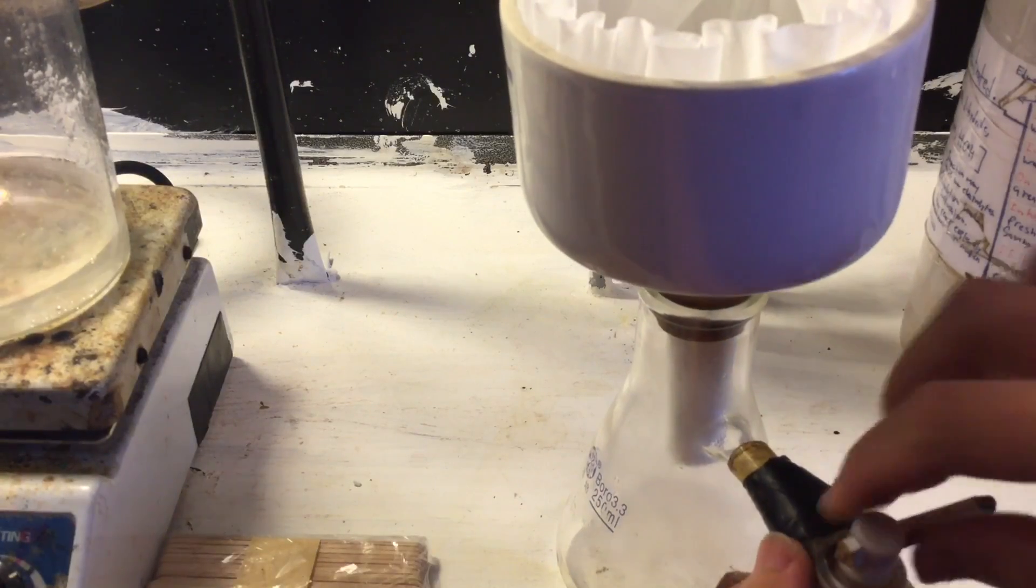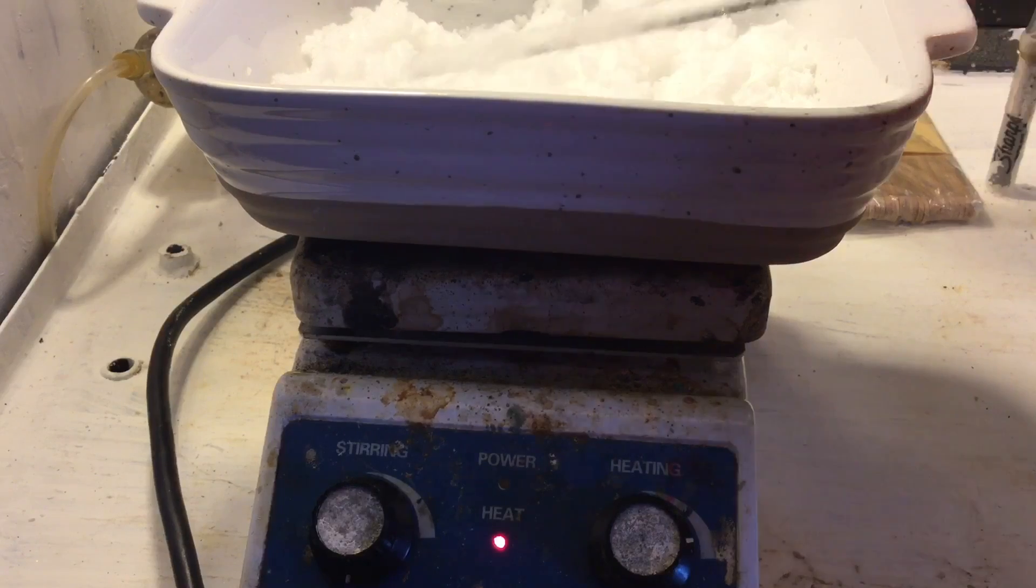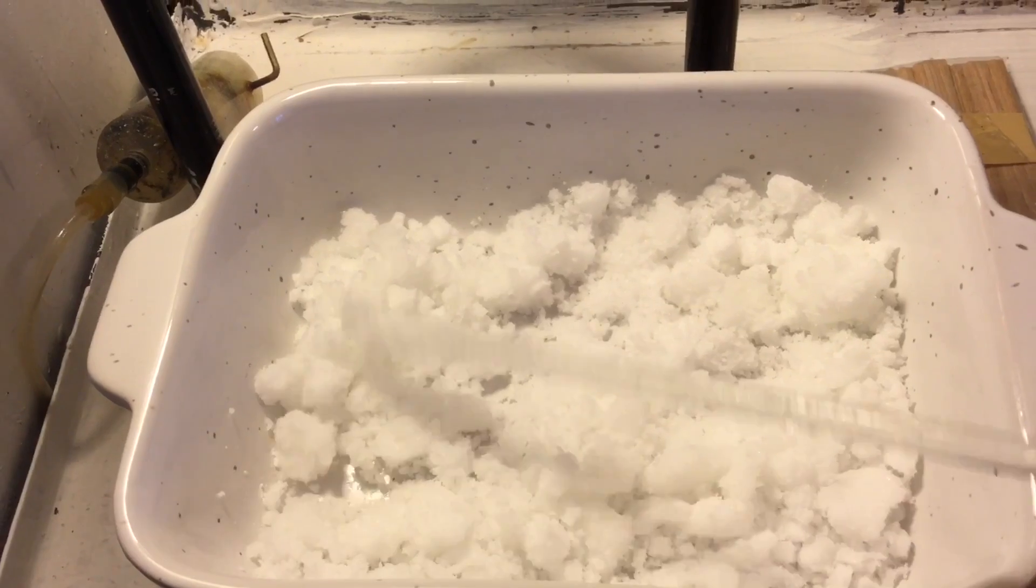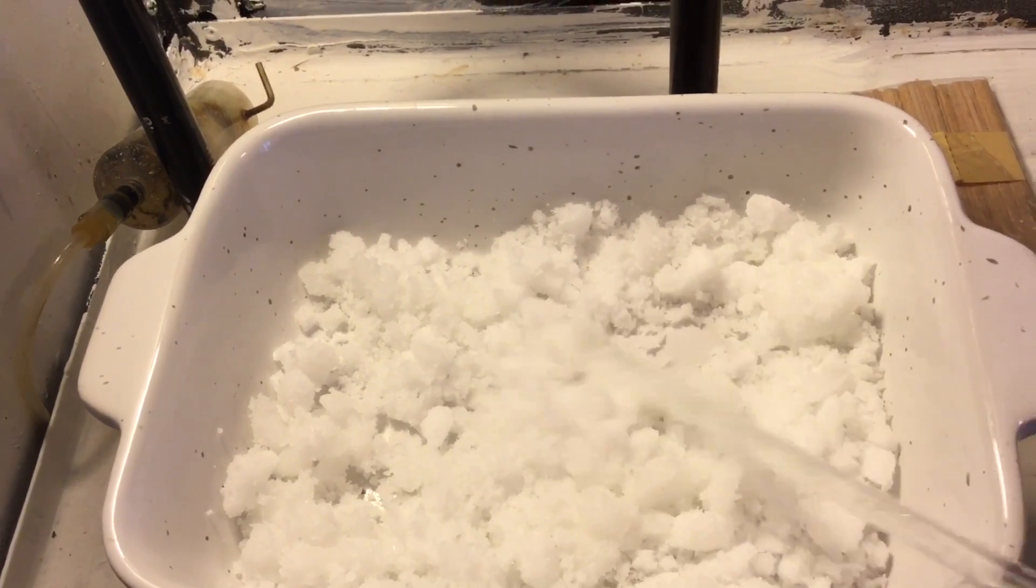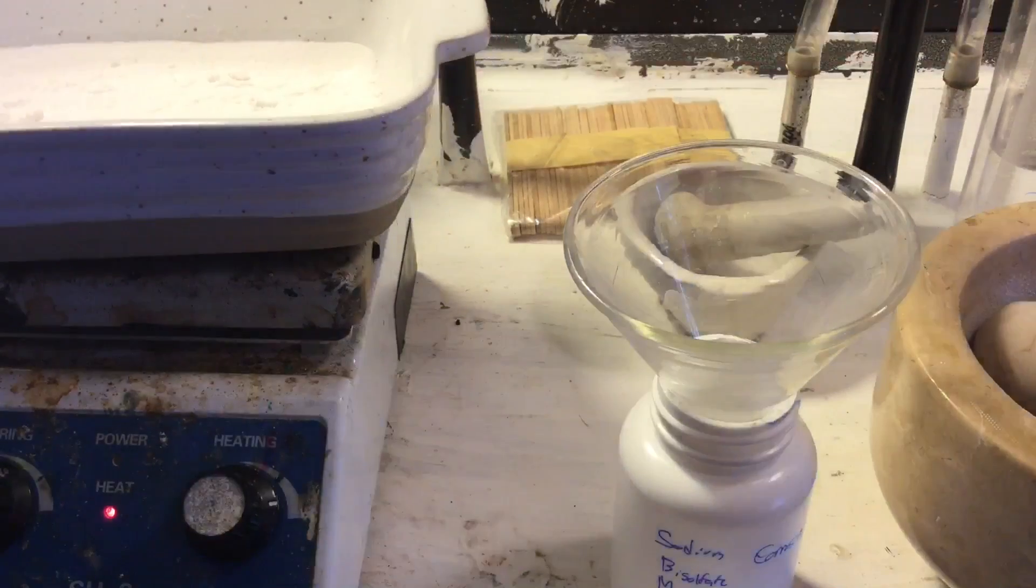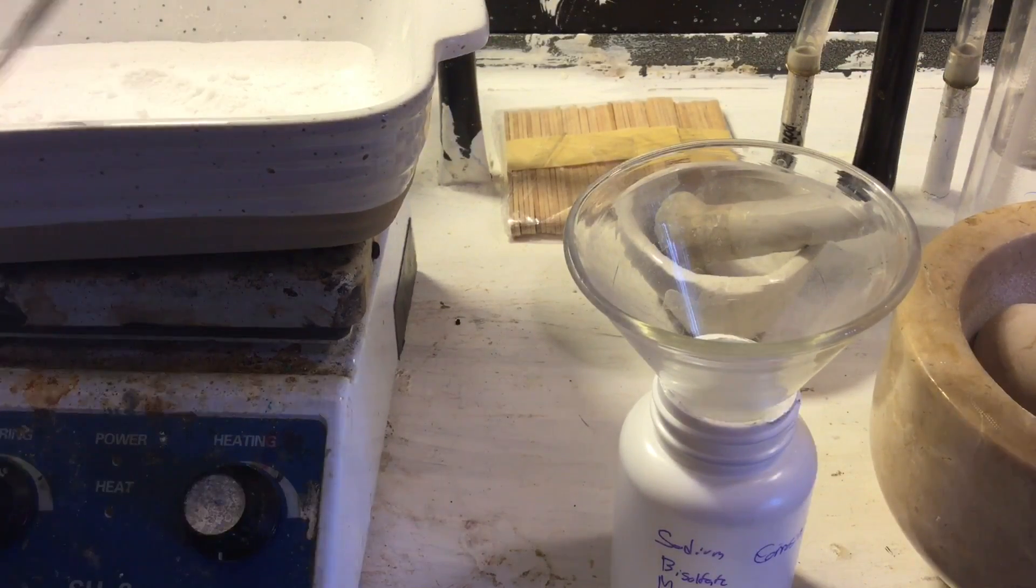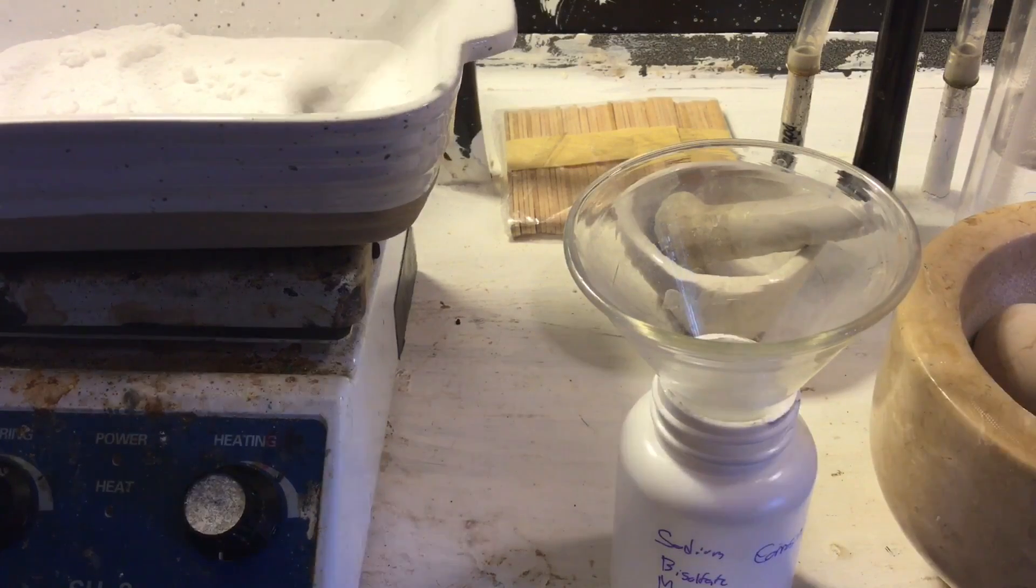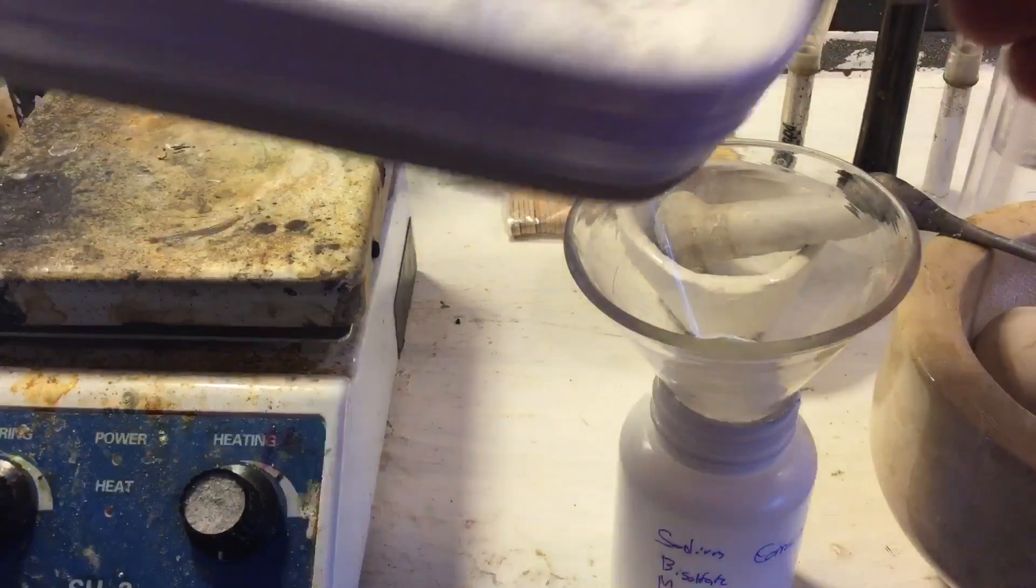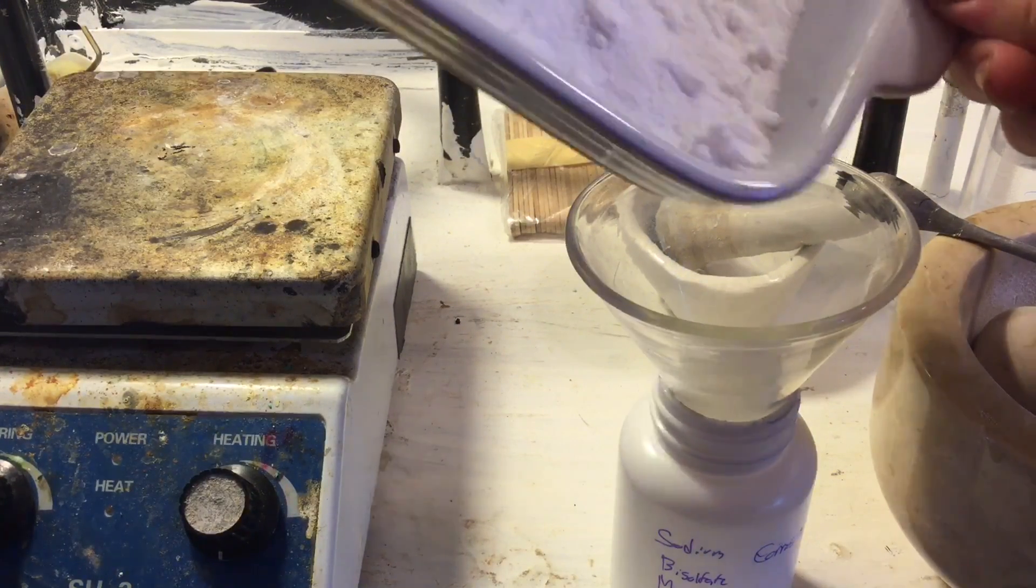Here's our sodium bisulfate drying on the hot plate. Be careful not to decompose it. I doubt your hot plate can reach like 400 Celsius, but just be wary that it may decompose. It also releases HCl fumes during this step as well, because it's wet with some HCl. Here's your nice dry and fine free-flowing powder, although it's still sort of fuming HCl, but not much.